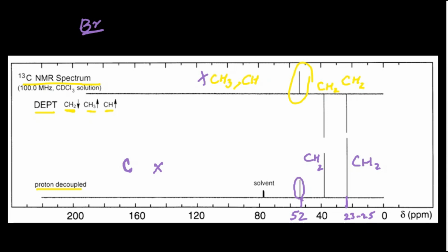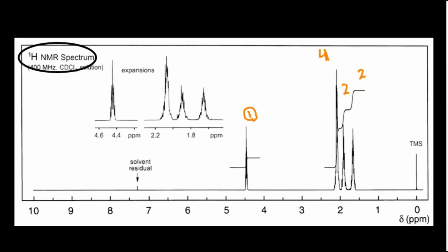So now you have the information that two kinds of CH2 group are present, and also the CH group that is directly attached to the bromine, as we concluded from the chemical shift value in the proton NMR spectrum. Here in the proton NMR spectrum, I have given the integration values above each line that I extracted from this scale value. Here 1, 2, 3 and 4, we got a total of 4 types of signals, as you may see in the expansion.